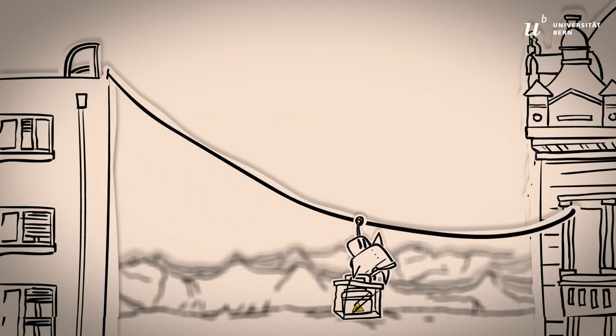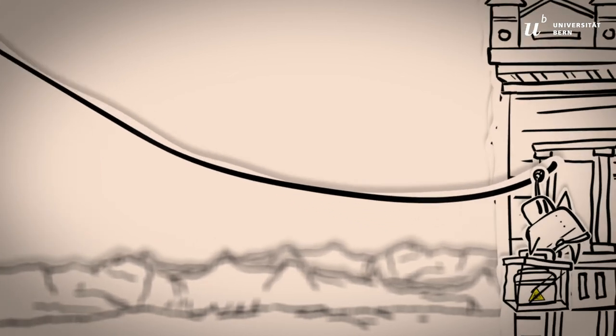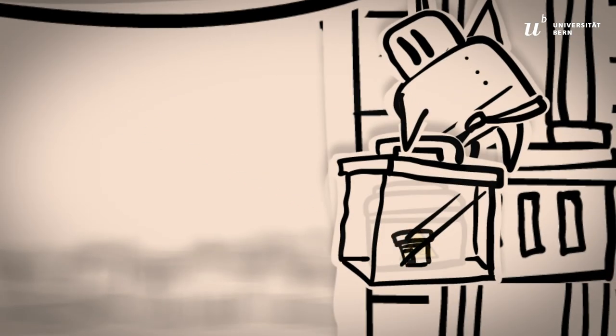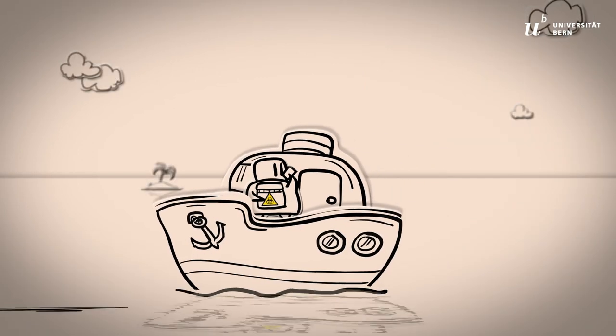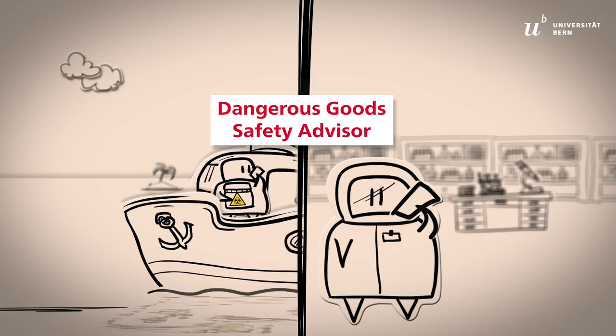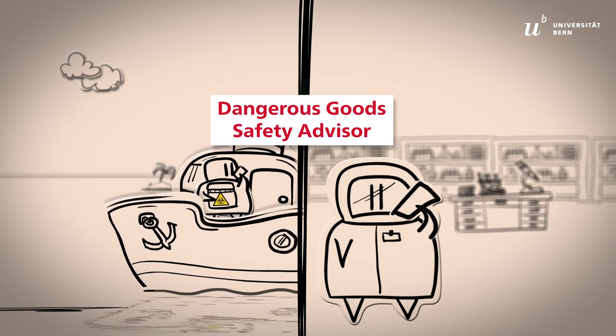For transport from building to building, use a robust and leak-proof container as a third layer of outer packaging. For national and international shipping, consult the Dangerous Goods Safety Advisor from the Risk Management Department.